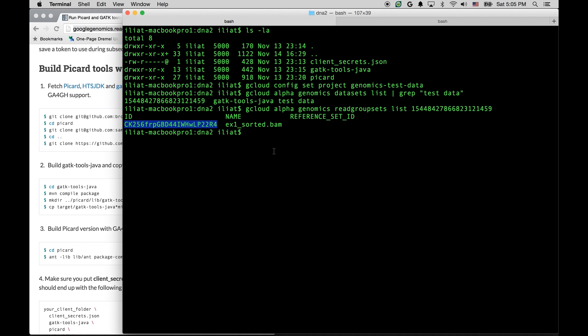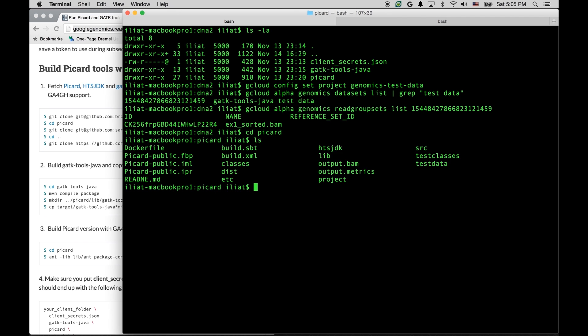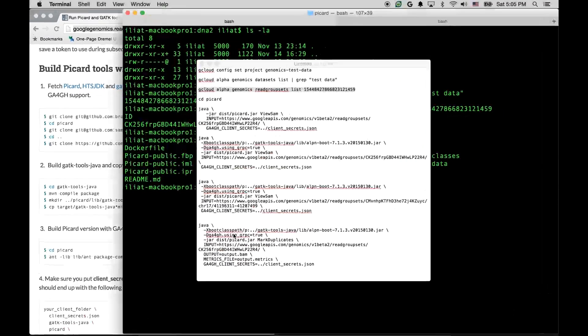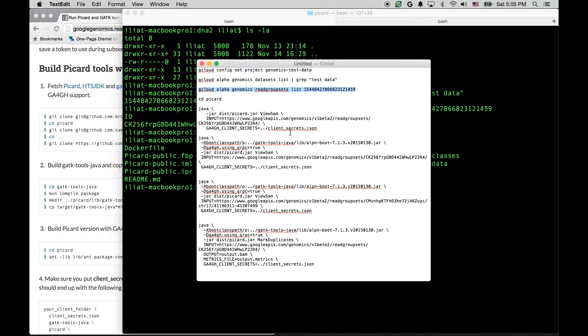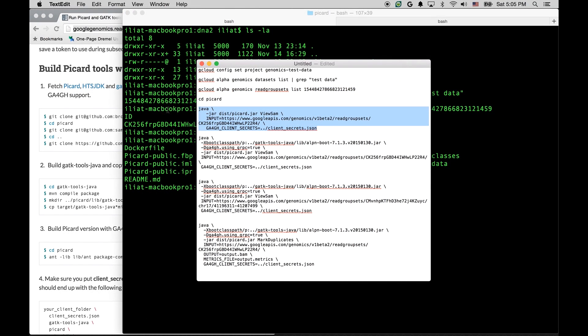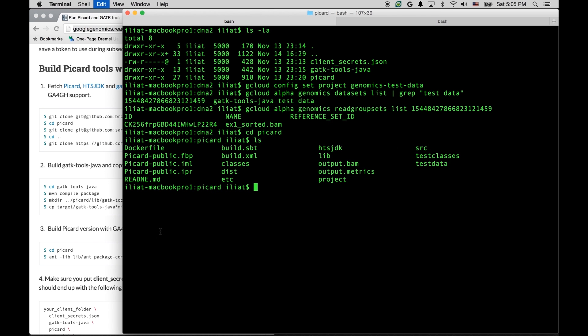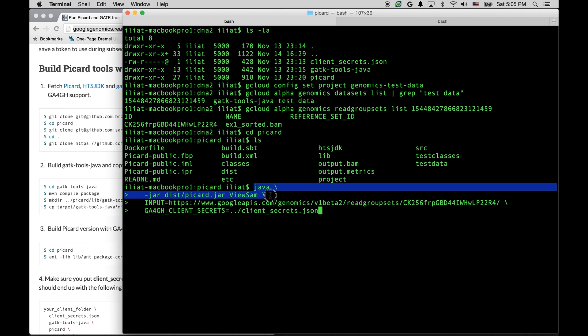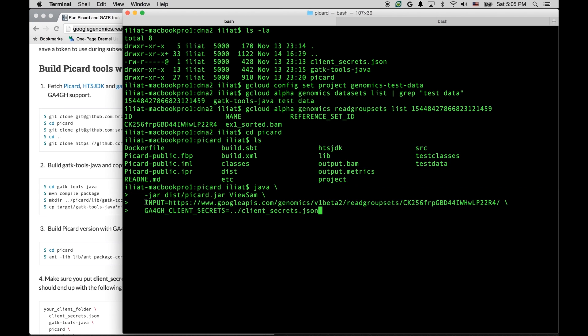Now, I'm going to paste the command line and explain its components. But first, let's switch to the Picard folder. So we have the standard Picard invocation here. We are using Picard jar, and we are issuing the ViewSAM command. Now, let's look at the input parameter, which is here.